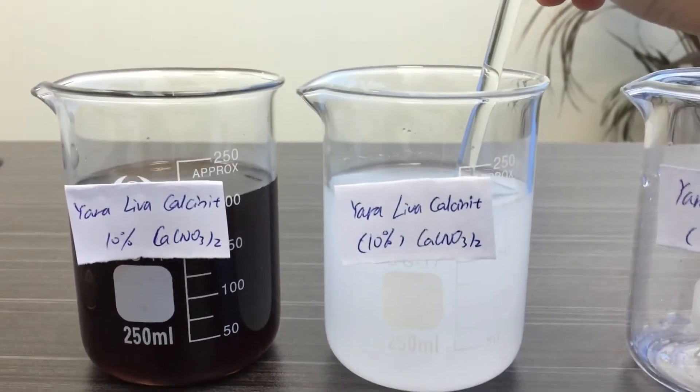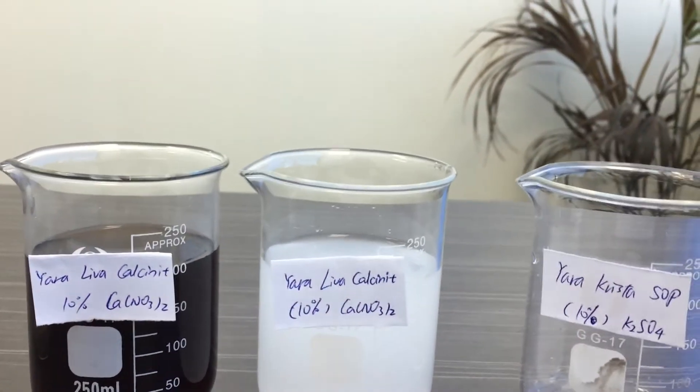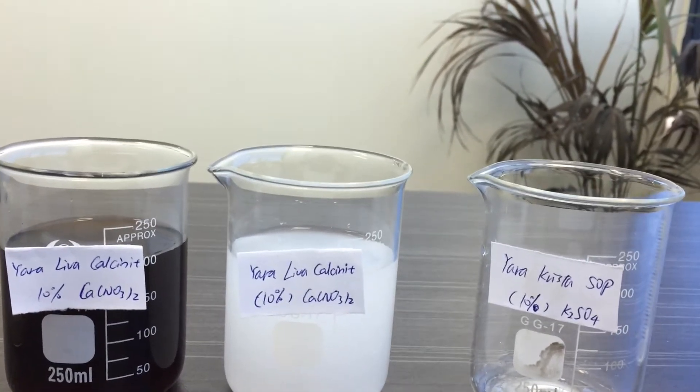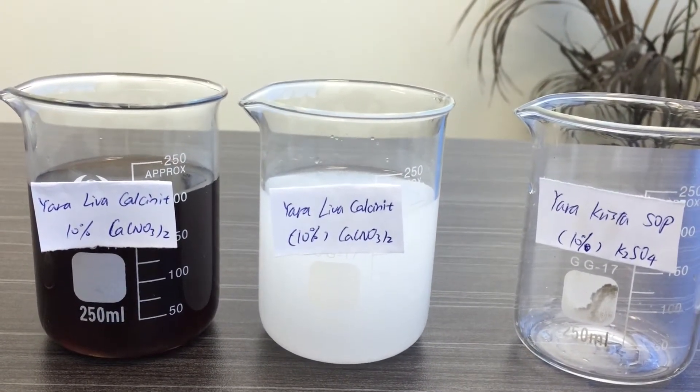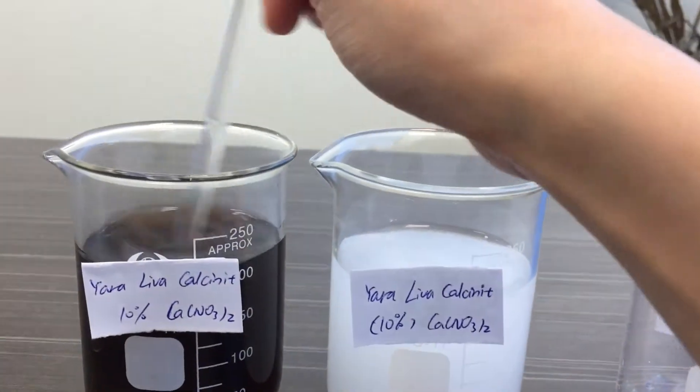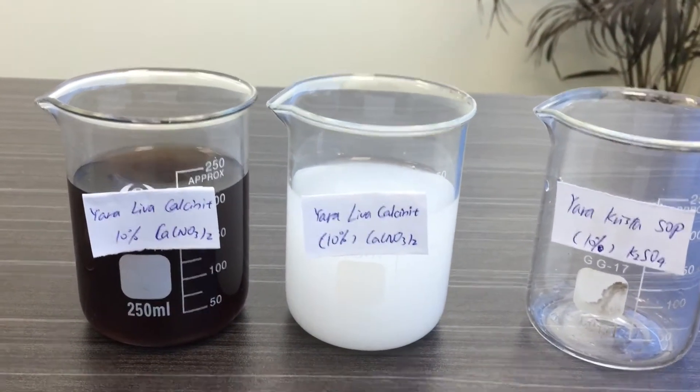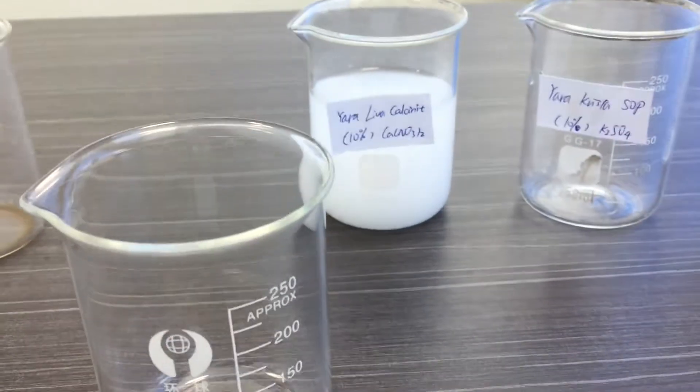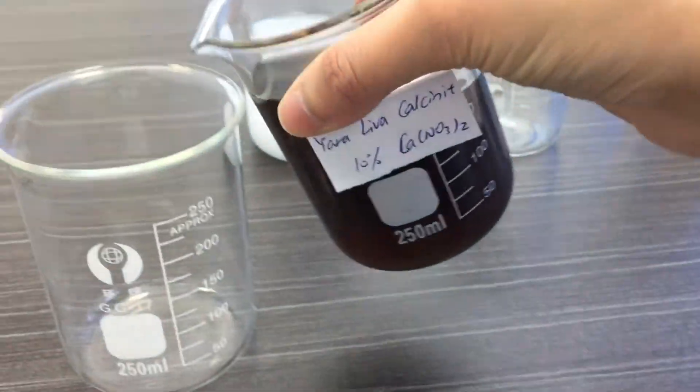So as we can now see after one minute of vigorous stirring, the right one is calcium nitrate mixed solely with potassium sulfate. It's really blurry and precipitation has formed, whereas the left one is still a clear solution. Here's the empty beaker, and as you can see the solution is just really clear.